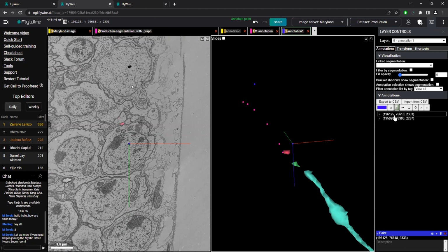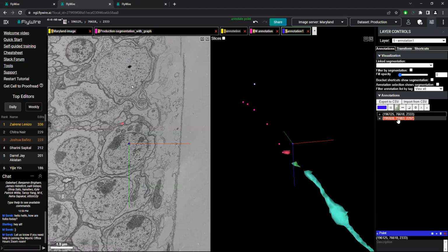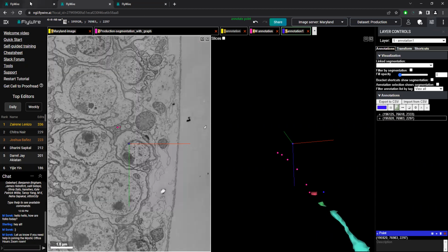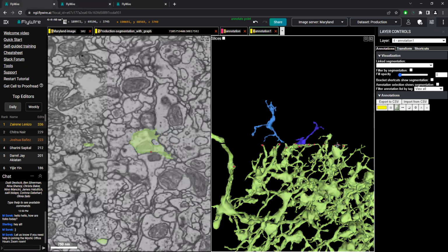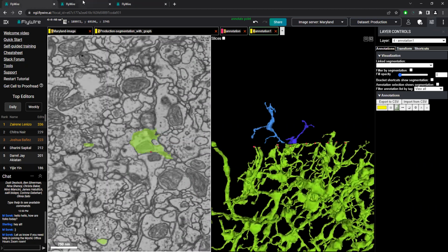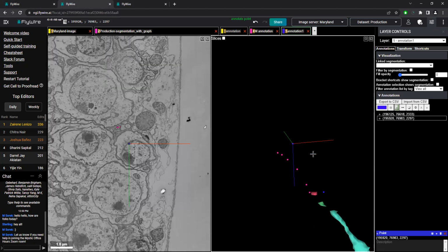So I completely understand. It's very nice to be able to just draw in where you've been. And as you saw, that's what I was using too, like in the Black Scores example here, where I was using the annotation points to say, hey, I've looked here, or hey, I haven't looked here, let's look here next. So definitely use those things to your advantage for figuring this out.